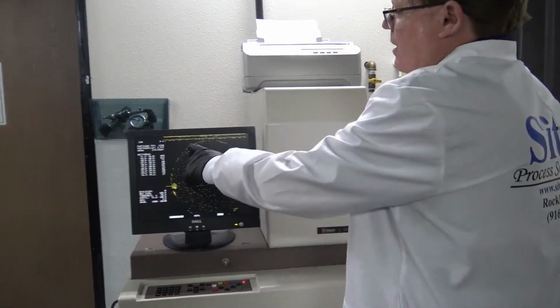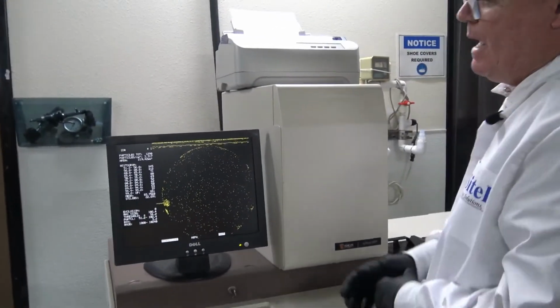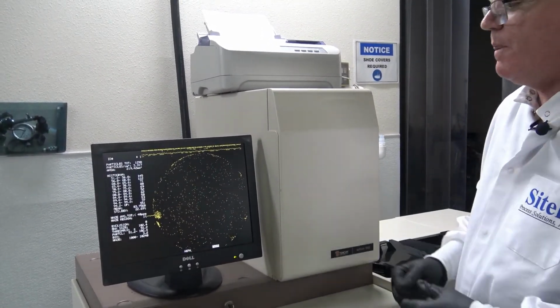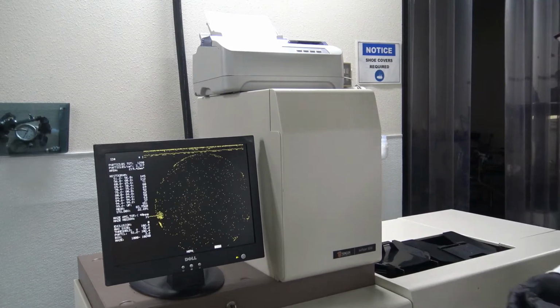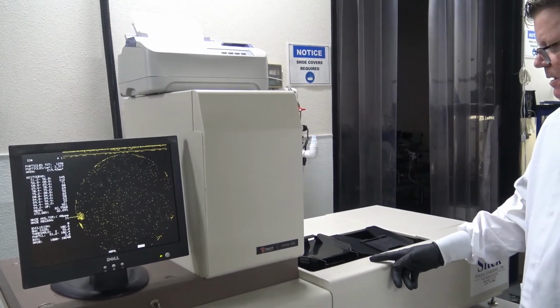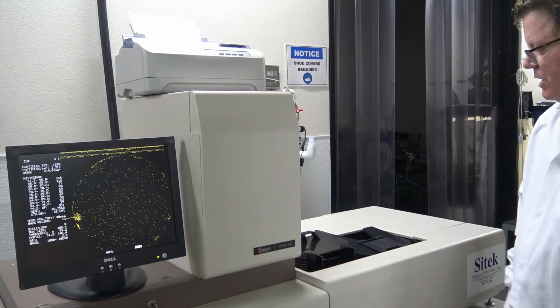And now we have 1,298 particles. You see, I think it went up by 50 particles in one run just because of the environment we're in. As you can see, it's back in here. Now actually when an index is back, it'll come back to home position.